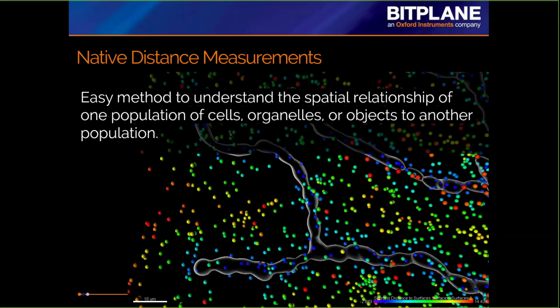What we've done is to utilize the creation wizards. I mentioned this before, and that's because we find the creation wizards to be such a nice way of attacking an image, essentially, and then generating your results. The vast majority of the time, when someone is using Imaris to do segmentation and object identification, they're using the creation wizards to do that in an automated way.